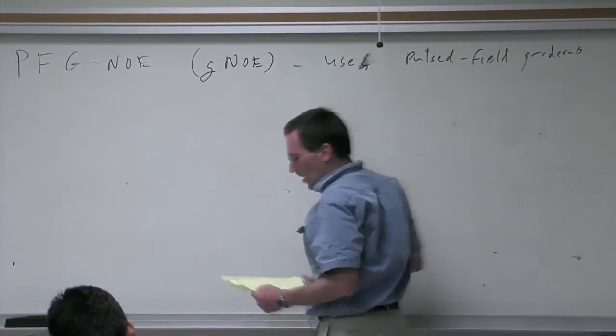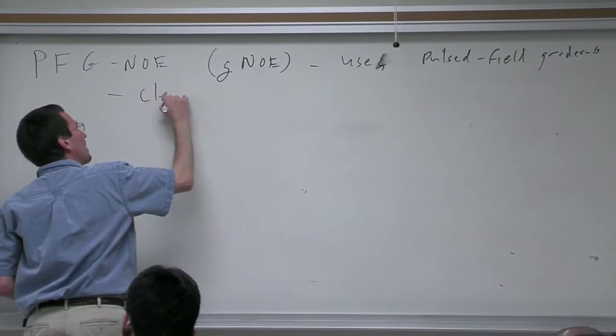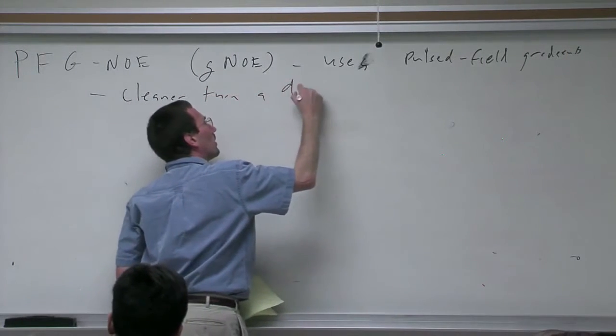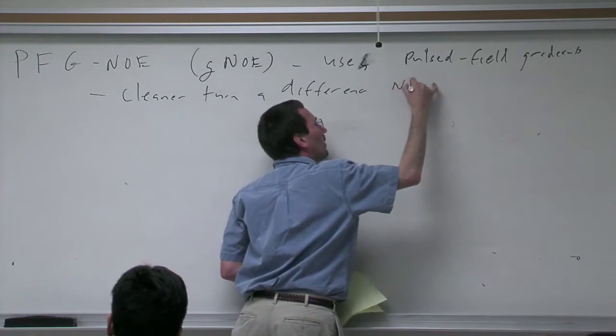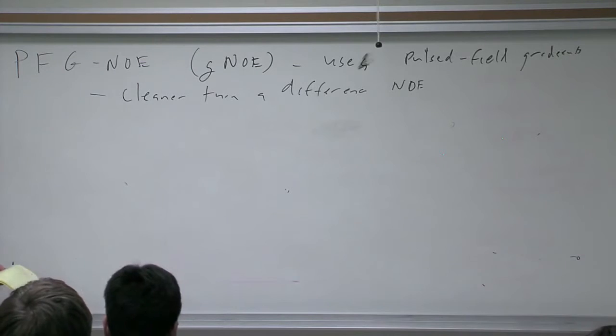I can talk more about that later, but right now I'll just say it's cleaner than a difference NOE. You'll be doing this with your strychnine sample.